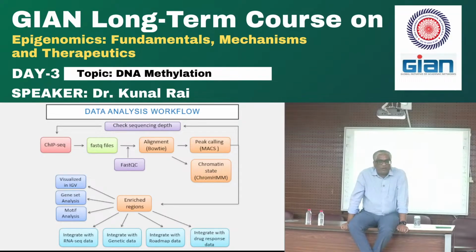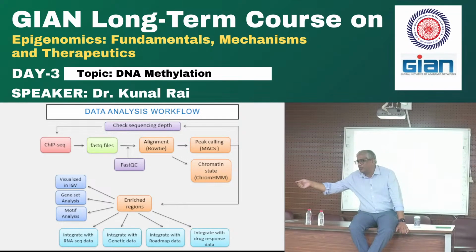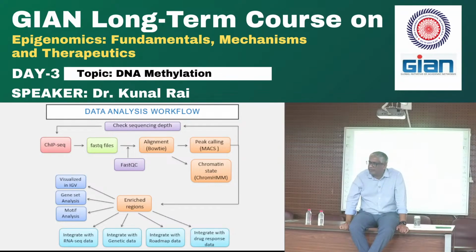We figure out what fraction of the genome is marked by whatever you're looking at. You calculate a rough estimate of how much that should be and how many reads I need to cover that portion. And then you say, okay, I need at least 20 to 30 times to not make an error of randomly sampling, okay? I hope that makes sense. If it doesn't, come to me later. I'll try to give you something to read.